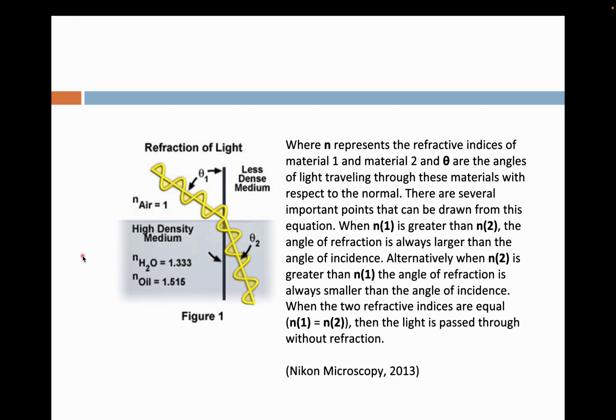And the reason behind that is because if you do a schematic visual to observe how light passes from the source to the object to the optical lenses, you'll see that in very high power, very highly magnifying objectives, the complication is the working distance becomes so small or so narrow that you have to ensure a continuous journey or movement of light.